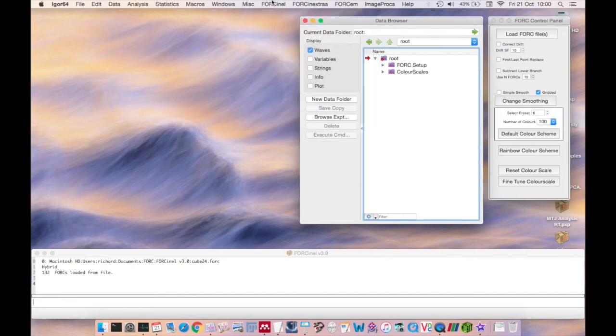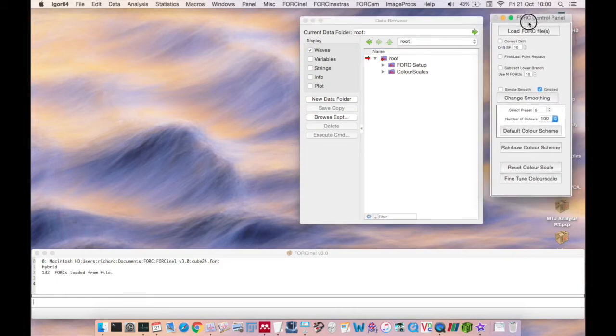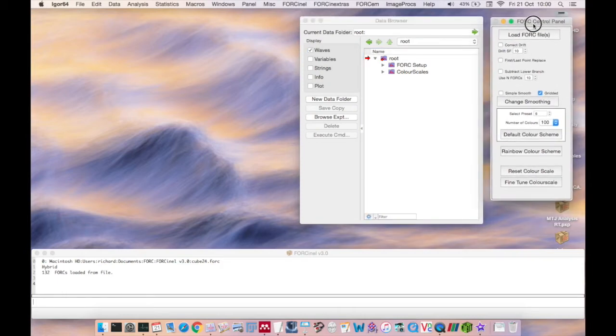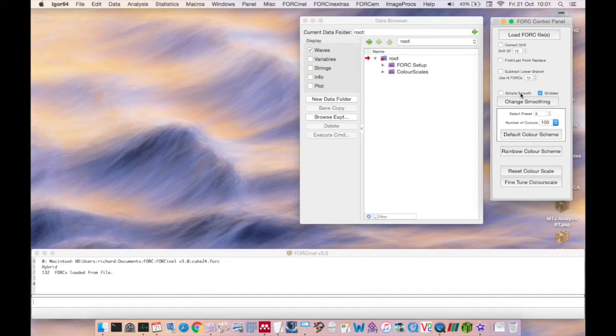Secondly there's the Fork Control Panel, which provides a means to control automatic data pre-treatment, such as drift correction and lower branch subtraction, that are applied whenever data is loaded. The Control Panel also provides access to key controls for smoothing and displaying fork diagrams.